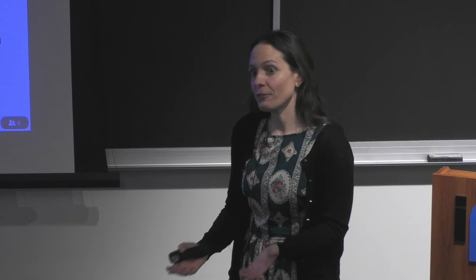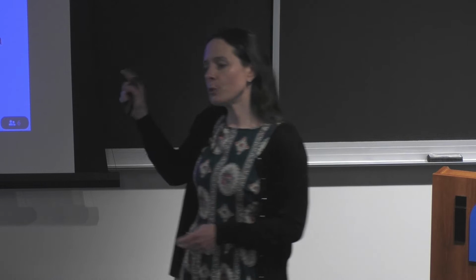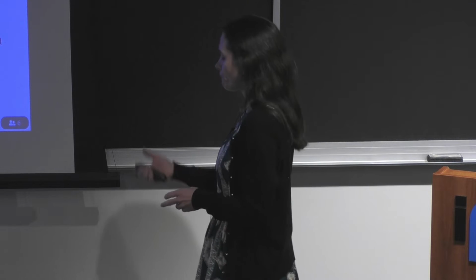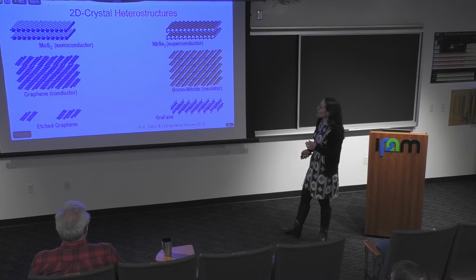So although the sample prep is in theory quite straightforward, in practice there's only been around 20 different papers that have come out, almost entirely from this research group, using graphene liquid cells to do reactions, and all of those reactions have been beam-induced processes, or looking at the native solution, the properties of the native solution. So we wondered, could we improve on this process?